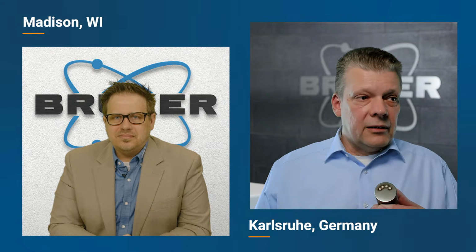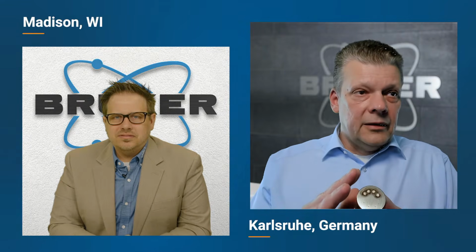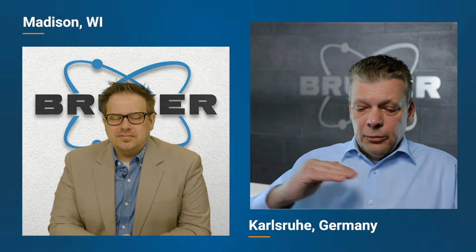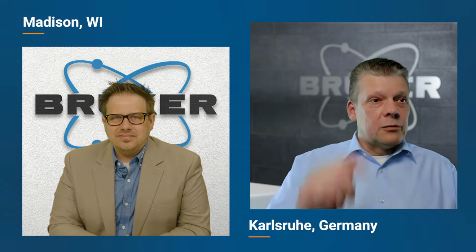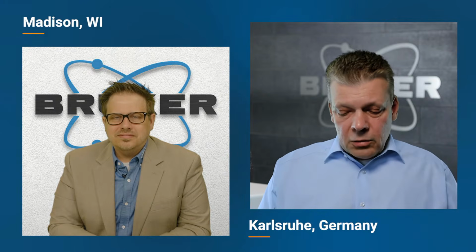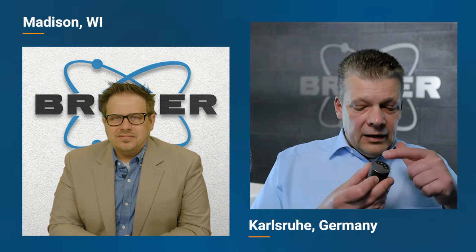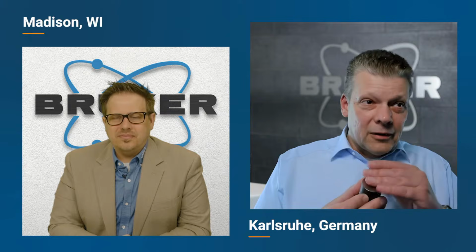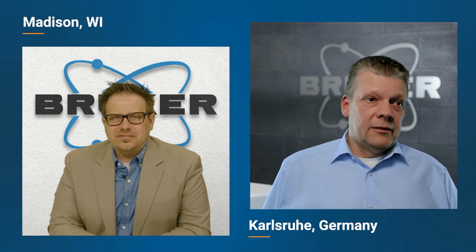Maybe you see here little scratches on the material. That is ideal. If you had it smooth like a mirror, it can happen that the spark that we shoot on the sample is just reflected somewhere else, and that would create a non-energetic discharge. That's nothing we want. Normal grinding with, let's say, 80 grit paper is enough. In the end, don't touch it, because that would create contamination from hands and so on. That is the only requirement that we have.